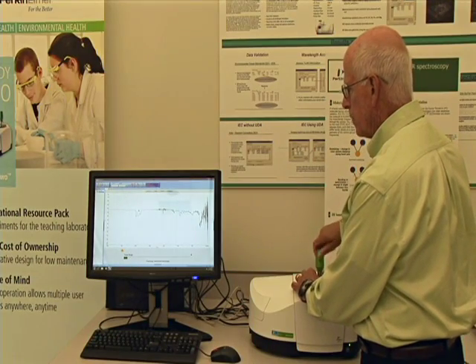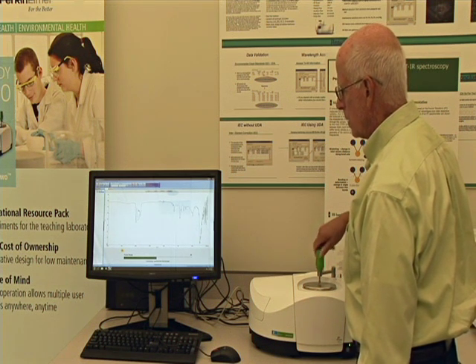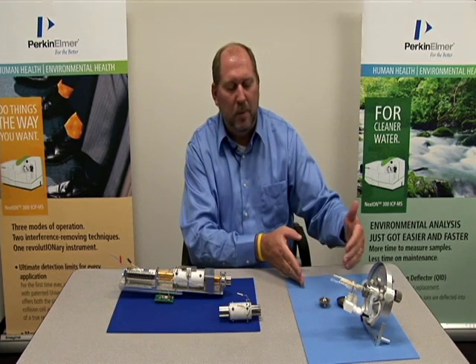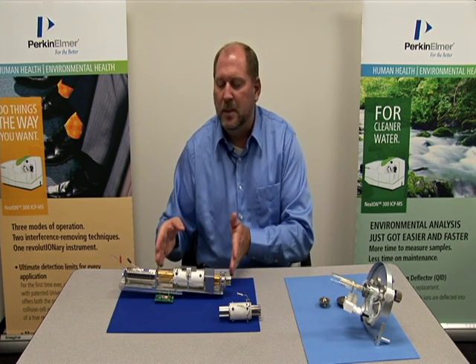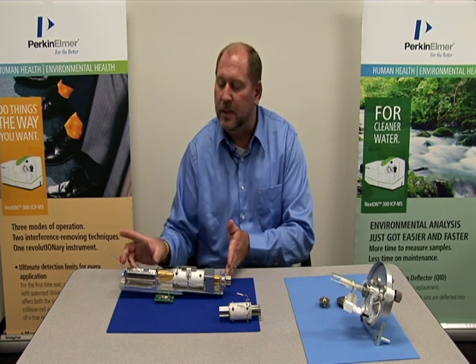And you should see two things happen. First of all, in the bottom of the screen you should see some energy being placed on the sample, and you should also see a reasonably good spectrum. We bend it 90 degrees and focus it. It may go through the cell, where we can remove any interferences that exist, and then into our analytical quadrupole, where we select for the mass that we want to read on the detector.